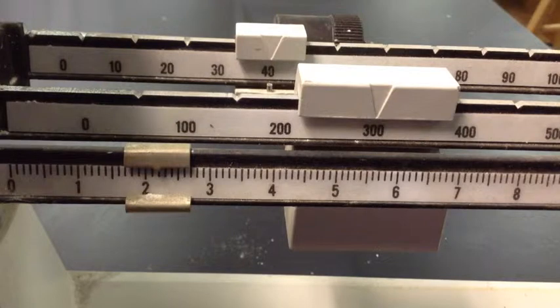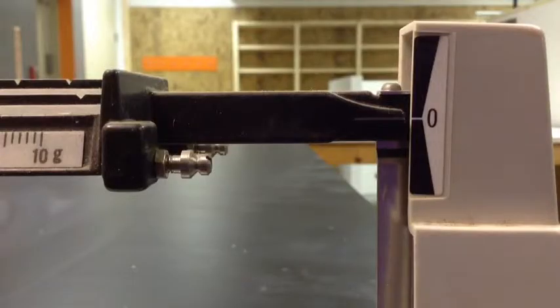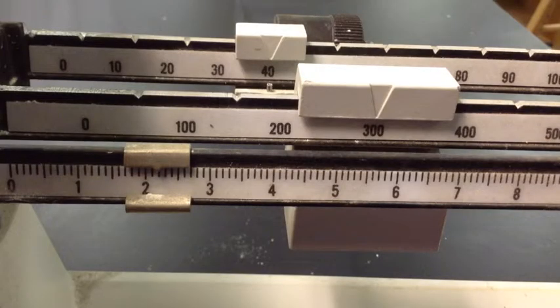And now I have 342.2 grams. Now I can start to slowly add my dry ingredient to the bowl sitting on top of the pan that has already been zeroed out. And I will gradually add more and more material until my beam hits the 0, and then I'll know I have exactly 342.2 grams of dry material inside my container.